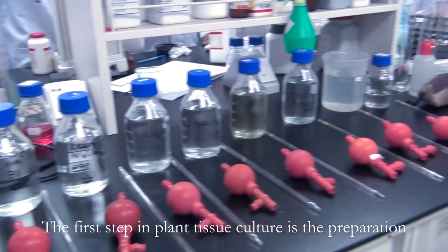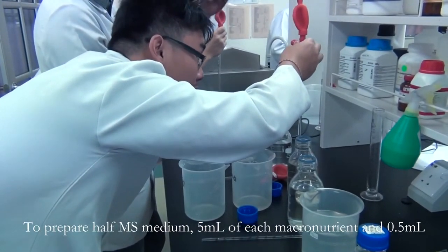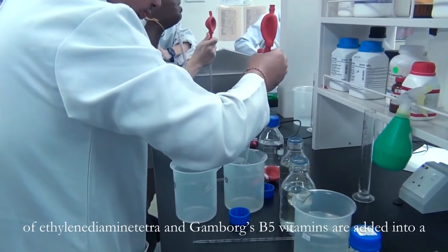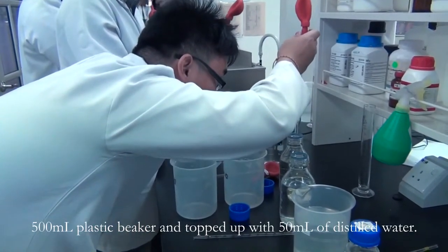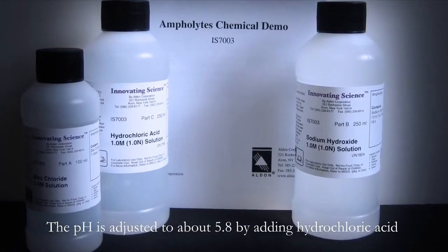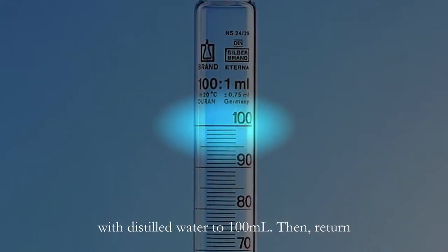The first step in plant tissue culture is the preparation of culture media. In this practical, we are using half MS medium. To prepare half MS medium, 5 ml of each macronutrient and 0.5 ml of EDTA and Gamborg's B5 vitamins are added into a 500 ml plastic beaker and topped up with 50 ml of distilled water. 2 grams of sucrose is added and the solution is stirred with a magnetic stirrer. The pH is adjusted to about 5.8 by adding hydrochloric acid or sodium hydroxide.